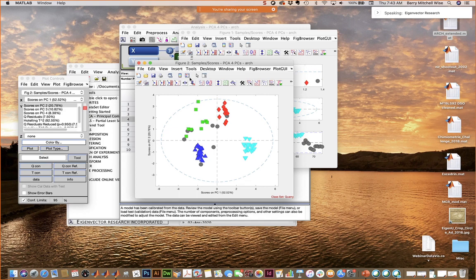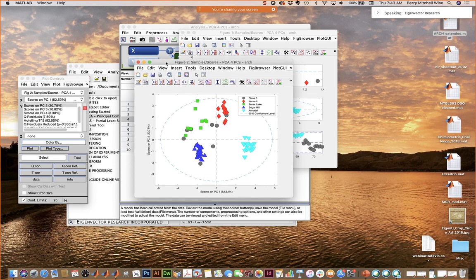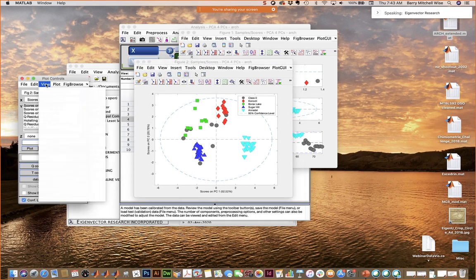And notice that these are colored by what class they are, in this case, where they came from. Well, that information was contained in the dataset object. That was one of the classes that we had for samples that are in there. And you can change what classes, what symbols you use for classes. And I had some questions about this the other day.